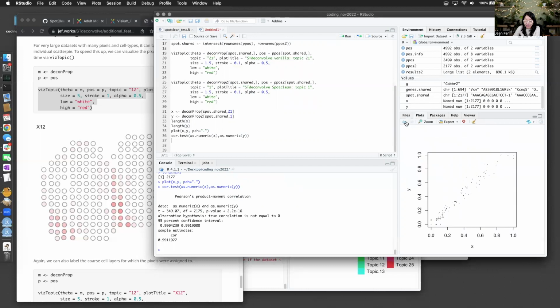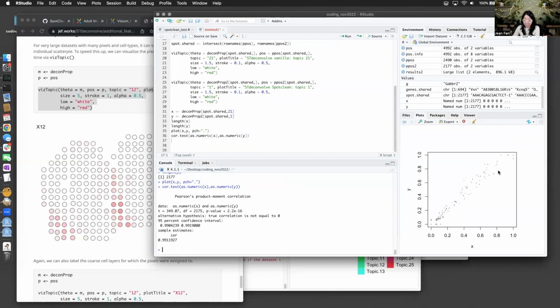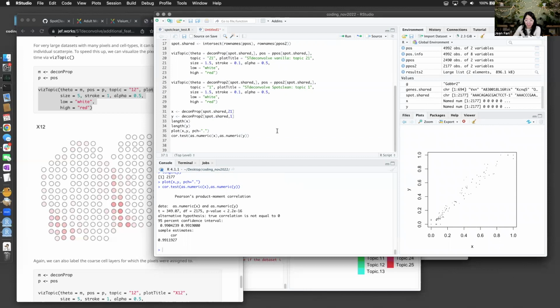But it definitely has changed things a little bit, and perhaps is giving a result a bit more consistent with the underlying histology, something for us to look at and check out. But overall, definitely promising. I think there definitely is a potential way to, especially if you have a sample that has a lot of lateral diffusion because of sample processing. I think in this case, as you've seen on the molecular level, there wasn't that much of a change. So I wouldn't expect the deconvolved cell type proportion to be drastically impacted either. And indeed, it hasn't really been, but the trends are consistent with what we would expect.